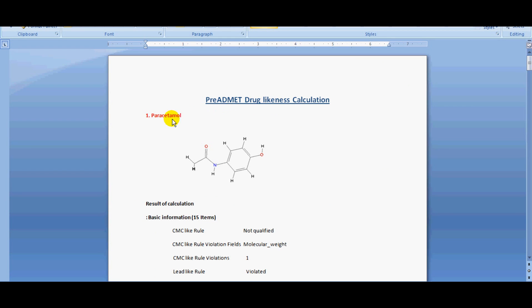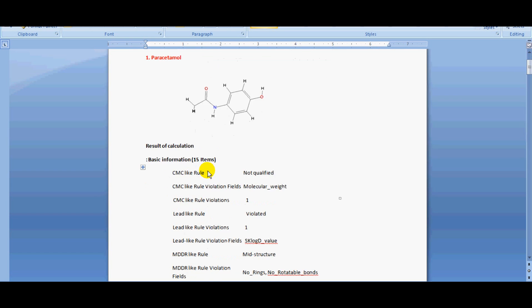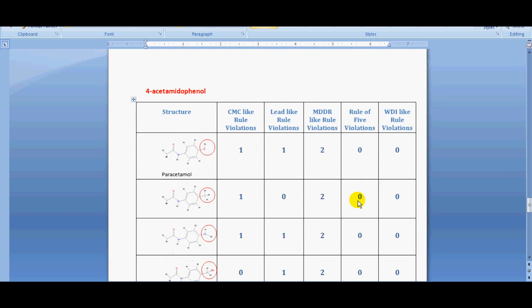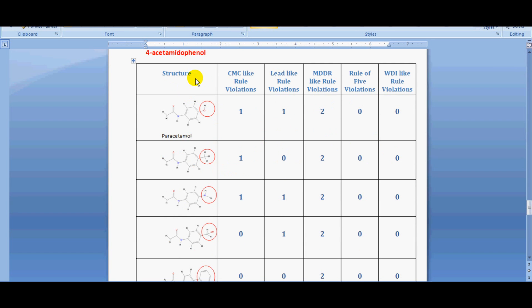Now we can analyze the result in the document. Each substitution and result of the drug likeness prediction calculation are given separately and tabulated. From the table, we can understand that each rule has different conditions to consider a compound as druggable.